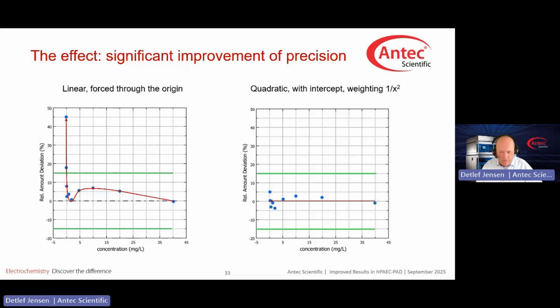And if this leads to improved analytical figures of merit, which it should, only then consider changing your SOP. In my humble opinion, this is the easiest way to improve the quality of your analytical data, and all it costs are a few mouse clicks.